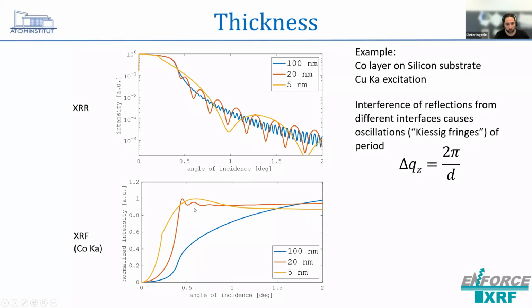Here it's changing widely the shape of the curve. So that's basically also why, in XRF it's quite similar. Typically for the evaluation, we calculate some simulations and compare them. But here, even for the evaluation, it's quite difficult to see what is happening, often if you have multiple layers. So there you have basically no other chance than to calculate some simulations and compare to a measurement curve.